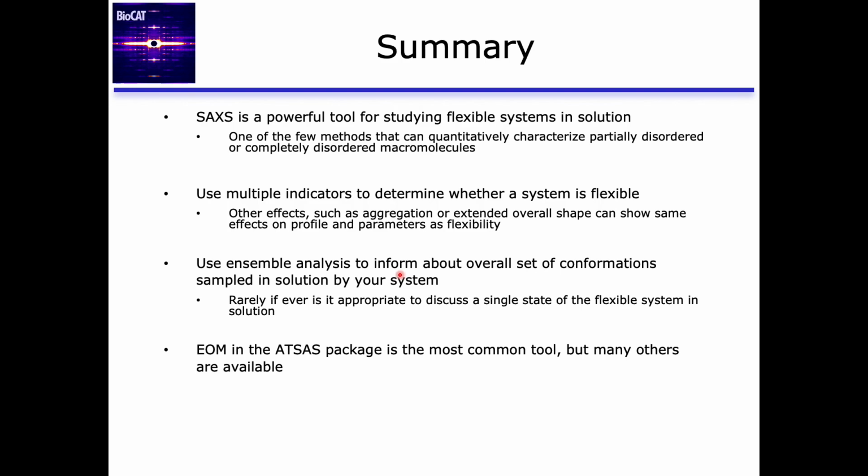Use ensemble analysis to inform about the overall set of conformations sampled in solution by your system. Rarely, if ever, is it appropriate to discuss a single state of the flexible system in solution. And then finally, as far as ensemble analysis goes, EOM in the ATSAS package is the most common tool, but many others are available.